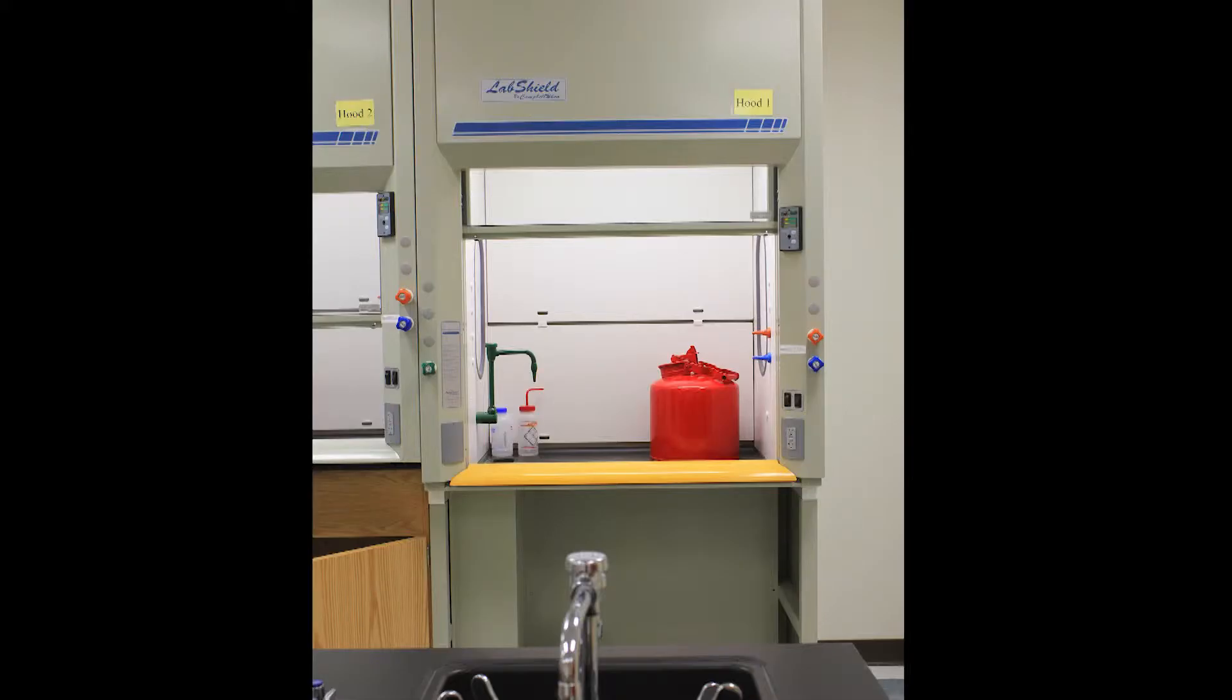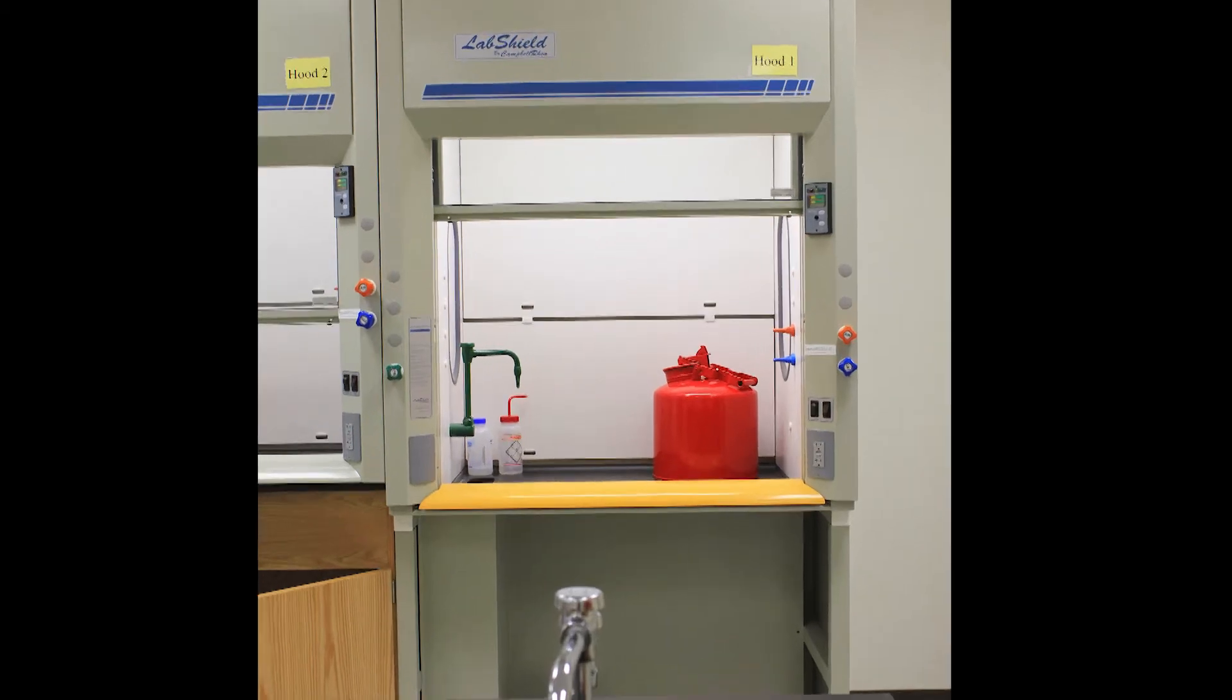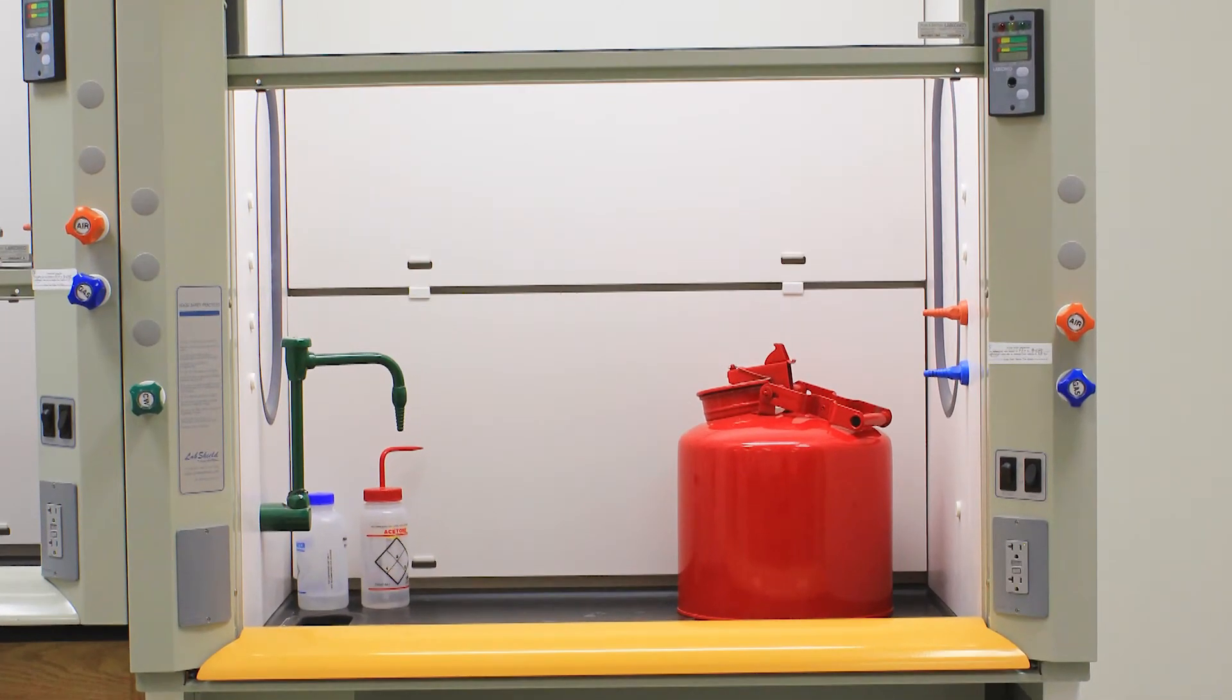Nonmetals will go into the organic waste container. Any waste containing a chlorinated solvent such as methylene chloride will need to be placed in a special container, as well as any waste containing iodine. These two waste containers may not be located in your lab.